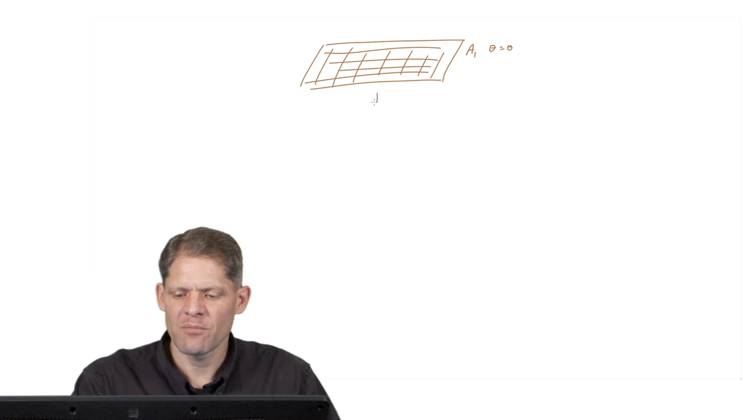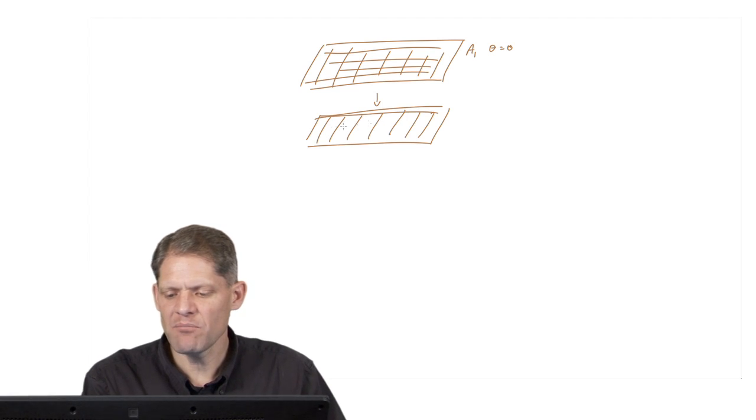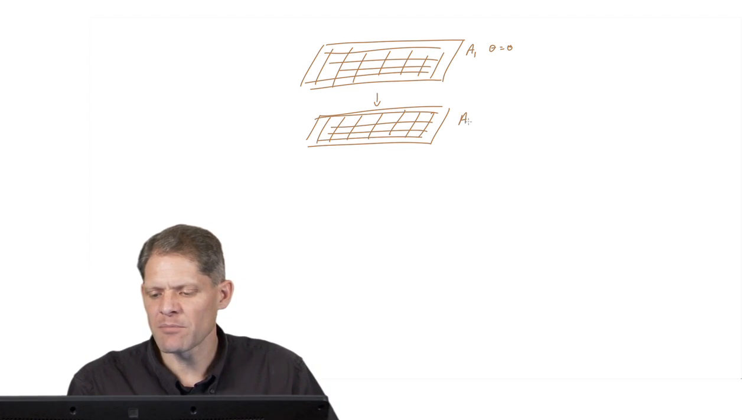So let's consider the incident electron as a plane wave traveling down the microscope column. And because it's a plane wave, the amplitude of each pixel here could be A, let's call it A1, and the phase at the beginning would be, let's say, 0. Then as this wave propagates down the microscope, at some point later, we'll have the same plane wave of, say, amplitude 1, but now the phase may have advanced, let's say, 45 degrees.